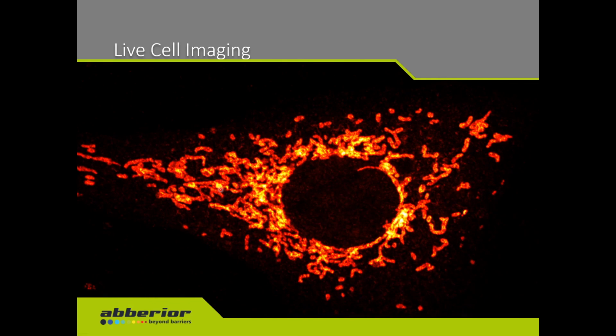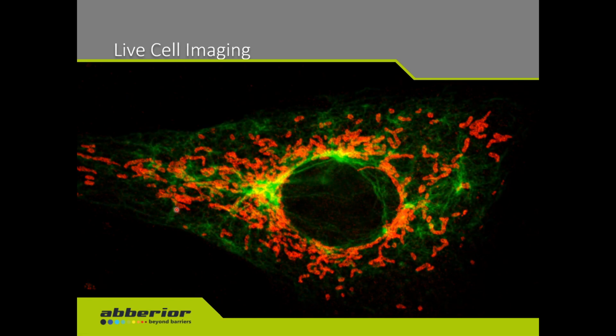And then we can create very nice images showing specifically our protein of interest. In this case, we have labeled TOM20, which is a protein located at the mitochondria. We could also do multicolor staining, for example, and so on and so forth. However, this is a fixed cell, a cell labeled with antibodies, and therefore what we see is just a momentum. If you want to observe movements and interactions of proteins, of structures, of organelles, then of course we have to label living cells.